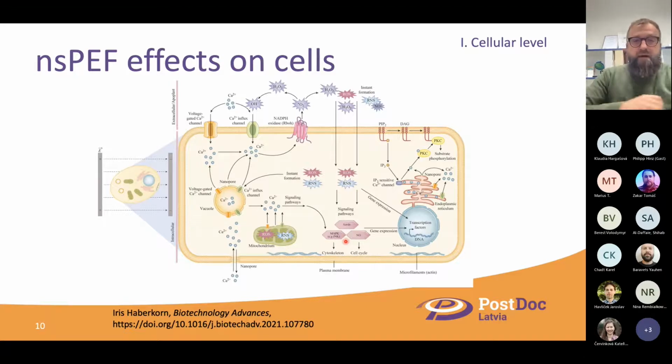But we saw that such a treatment using microseconds produces a lot of reactive oxygen species, which can act as a trigger for the nuclear factor kappa beta promoter. So of course we are thinking about and trying to build a system which can be used for nanosecond pulsed electric field treatment, as it is, let's say, a much better treatment, especially for some intracellular signals.